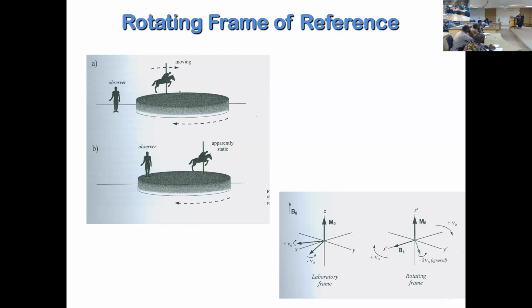This is the concept, because the vectors we are discussing, all these nuclei, are moving really fast, with the speed of light. When you see the spectra, you see their velocity in hertz. If you convert in ppm and multiply with the frequency of your spectrometer, you get the hertz. So there are only a few hertz that you actually observe.